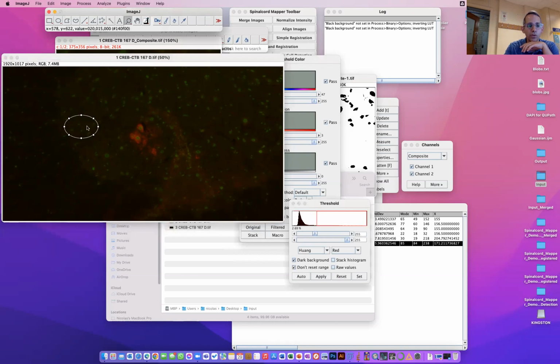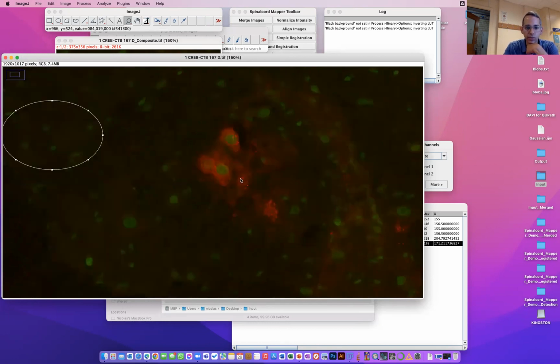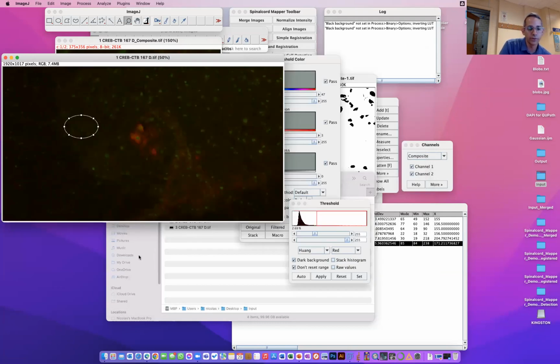You should, or you may, but the question at the end is, what does Islay want to look at? If it's an intensity that is normalized for his tissue, I would say yes. If he's looking at a relative intensity between the two, maybe not. If it's a proportion of pixels that are normalized, maybe not as well. But this is a very good point. You could take the average value that is outside of your region of interest and decrease it by this amount. So you will remove some noise that is outside. A good point.